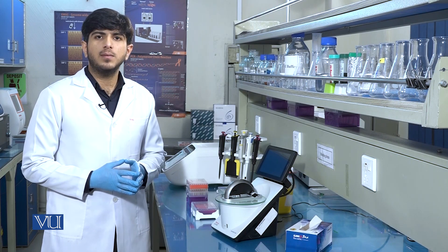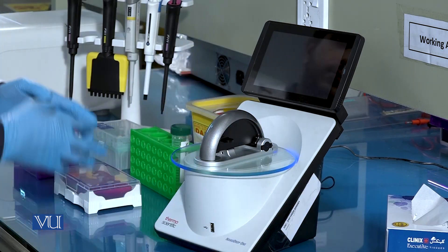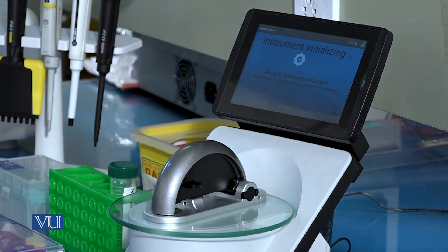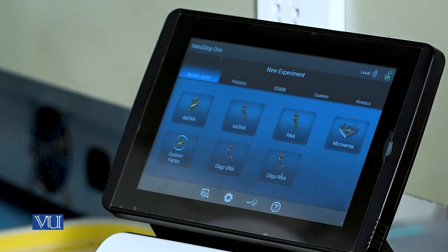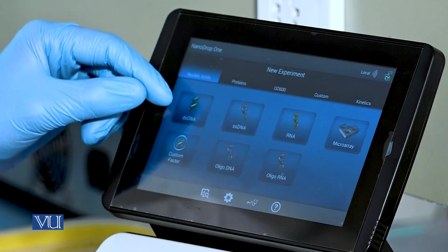While performing the experiment, first of all we have to turn on the NanoDrop instrument. When the program setup is initialized, we have to select the type of nucleic acid molecule for which we are going to measure the concentration. Since our sample is double-stranded DNA, we will select the double-stranded DNA option on the NanoDrop.